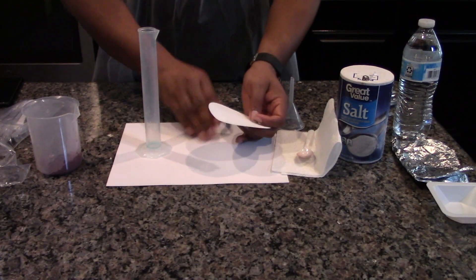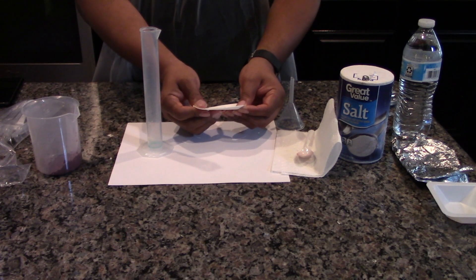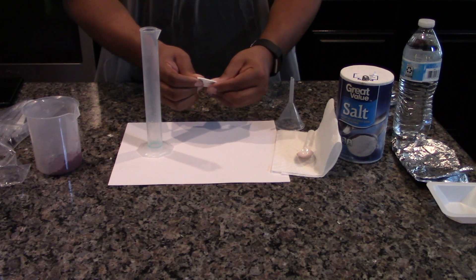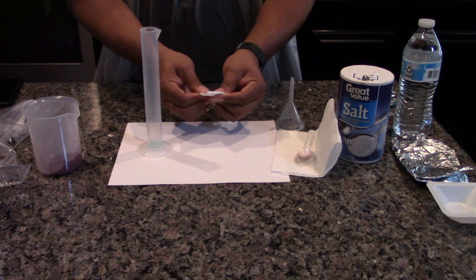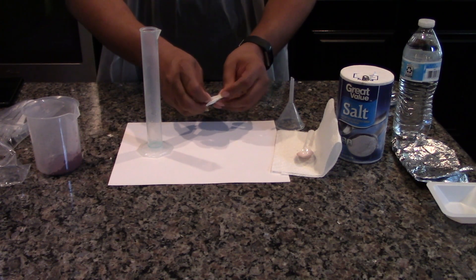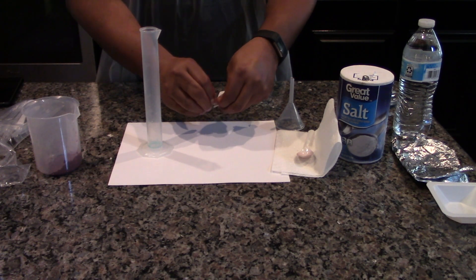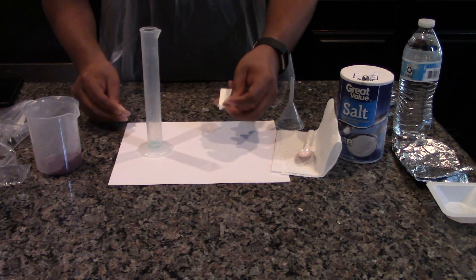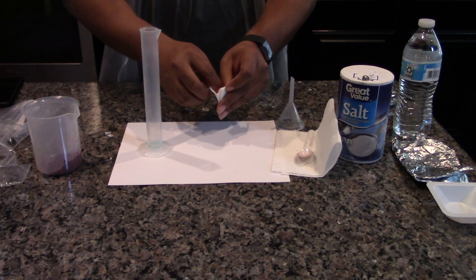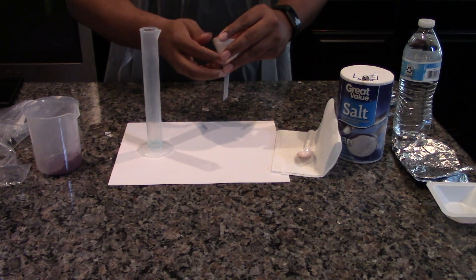Prepare the filtration setup. Fold the filter paper in half, and then in half again. Tear a small piece from the corner of the filter paper. The folded filter paper has four curved edges, two interior and two exterior. Gently separate one exterior edge from the three remaining edges until it makes a cone. Place the filter paper cone into the funnel.